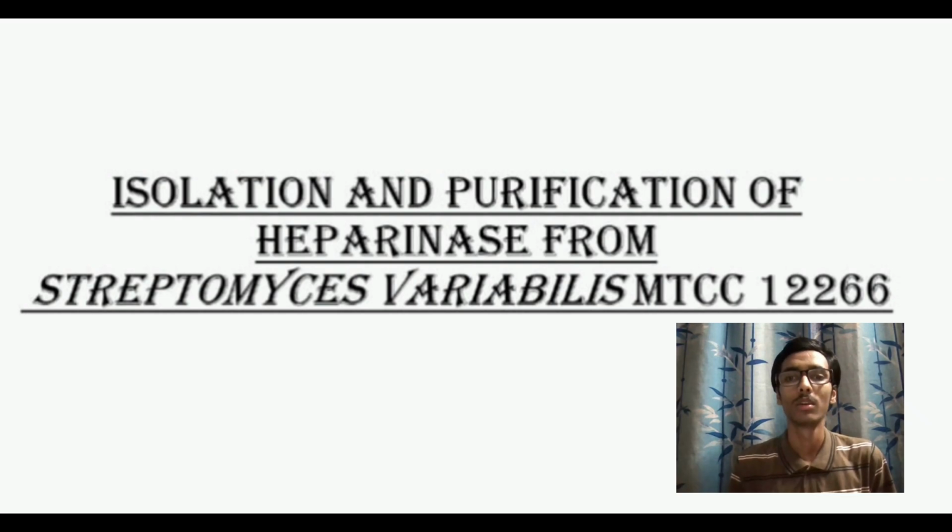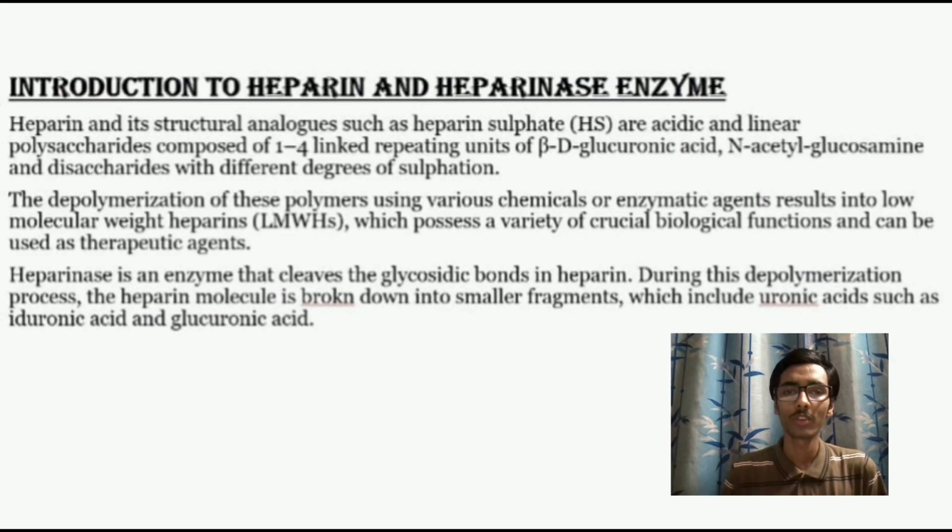Hello everyone. Today we are going to discuss a case study regarding the isolation and purification of heparinase from Streptomyces variabilis MTCC 12266. So first, let's have a brief introduction regarding the heparin and heparinase enzyme.